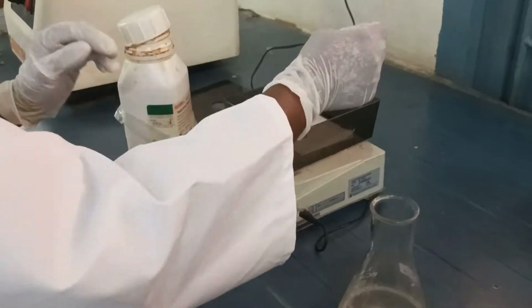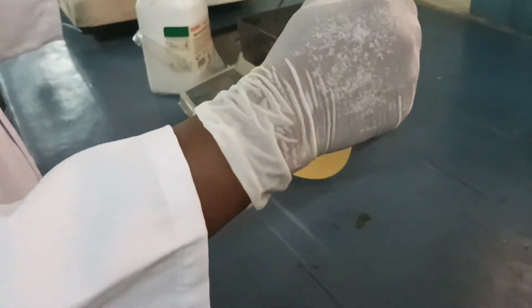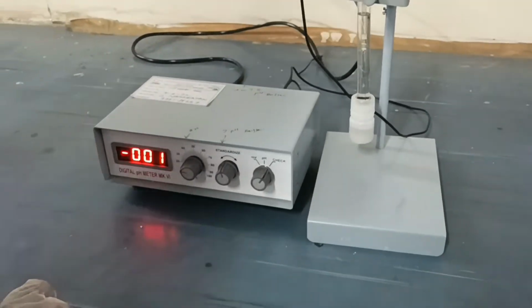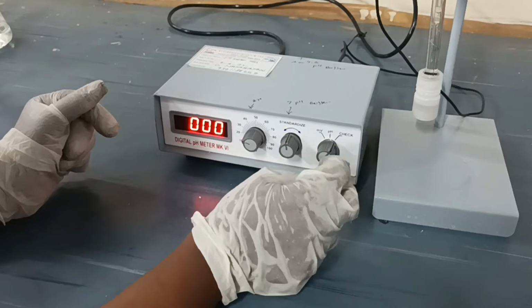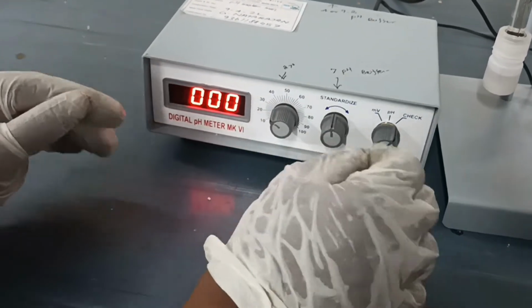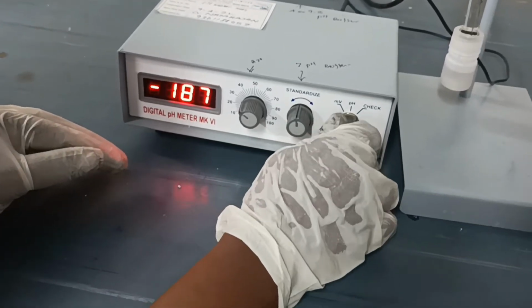pH is very important for microbial growth. Now, the pH is adjusted to neutral with the help of a pH meter. This is buffer tablet pH 4 and 7. The pH meter is an electronic device used for measuring the pH of any solution. pH meter calibration is required at regular intervals.